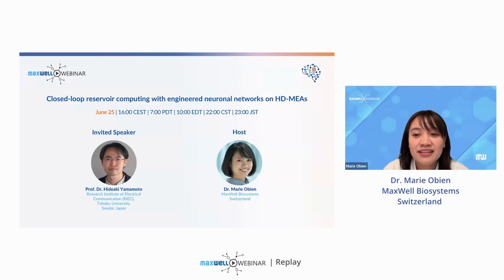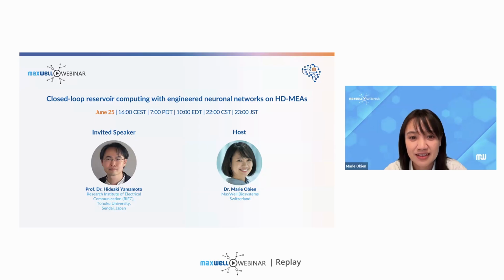Is there a possibility that the neurons in patterned networks connect outside of the connection channels, e.g. over or under the whole microstructure? In other words, how certain are the neural connections to follow the imposed microstructures in your case?